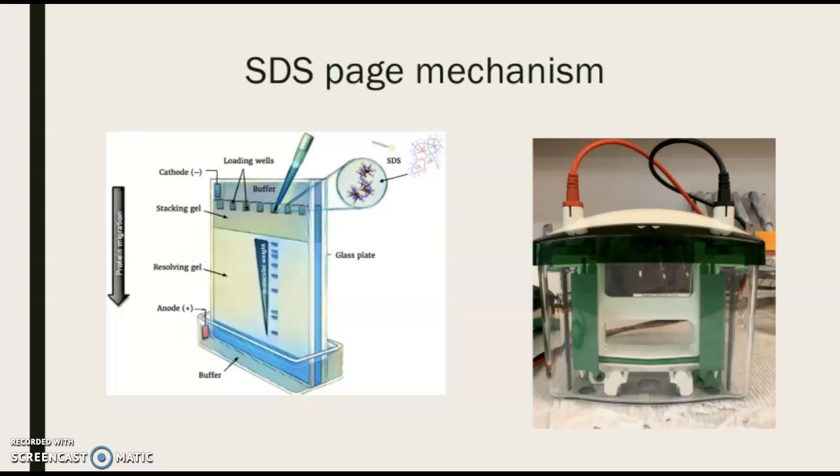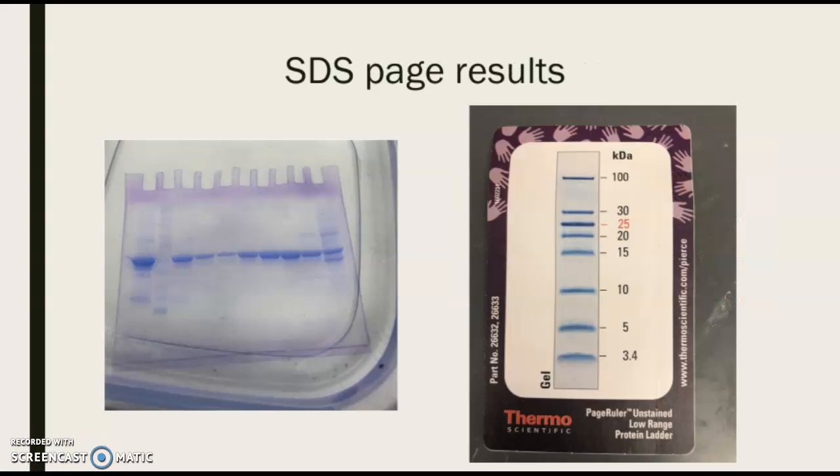So you will take this out of the package and you'll pinch it with that glass plate and put it between the green clasps. You will then fill the bottom up to the green rubber line that runs horizontally with buffer, and then you'll also run buffer in the middle where the SDS page is, and you'll load your samples. Since you use Laemmli buffer, you can see when your SDS page is running, your fractions moving down the gel. This usually takes about 30 to 45 minutes, depending on the voltage that you run it at. We usually use 80 volts.